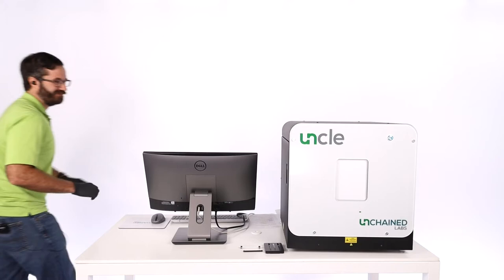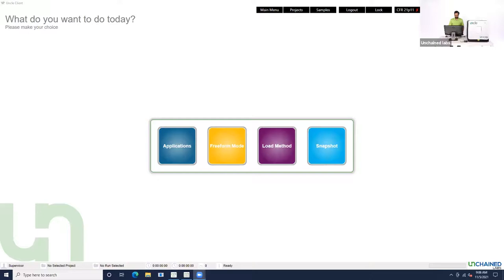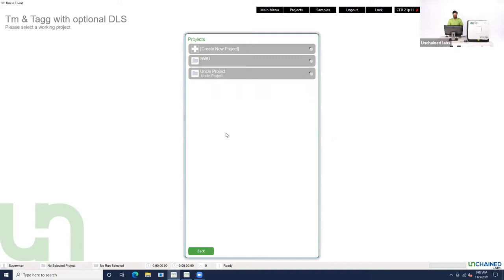Now I'm going to walk on over back to the instrument and show you how to set up an experiment. I'm going to share my screen so you can see the UNCLE client software — the software you use to control UNCLE and do everything you need to do. We'll go to applications and go to Tm & Tagg with optional DLS, which is the experiment we're going to be running. This is what we typically use, and about 90% of our customers are using it to look at protein thermal stability.